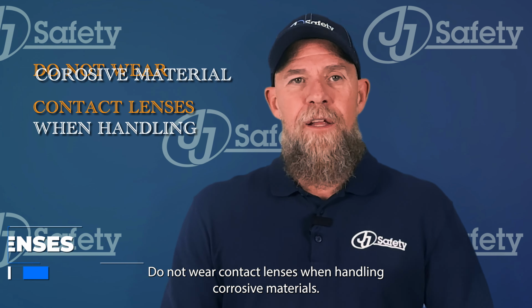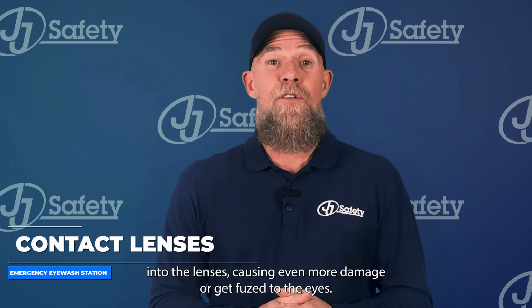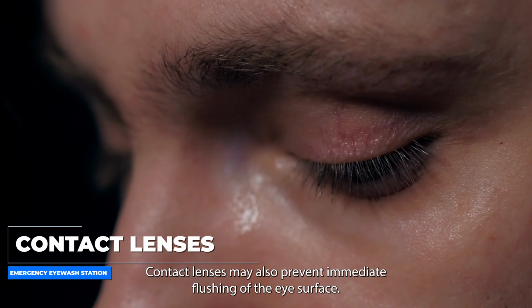Do not wear contact lenses when handling corrosive materials. The chemical may get trapped under the lenses, causing even more damage, or get fused to the eyes. Contact lenses may also prevent immediate flushing of the eye surface.